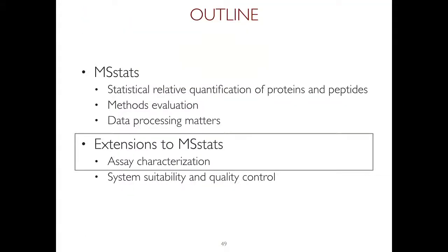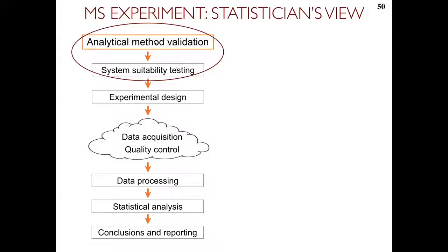Okay, and now the last part, which is actually not very long. I also wanted to talk to you about the things which essentially happen before we get to the experiment, and how much we need to do before we even start designing the experiment and collecting the data. So I've been emphasizing a lot the sample size, and the fact that we can measure things in a way which is reproducible.